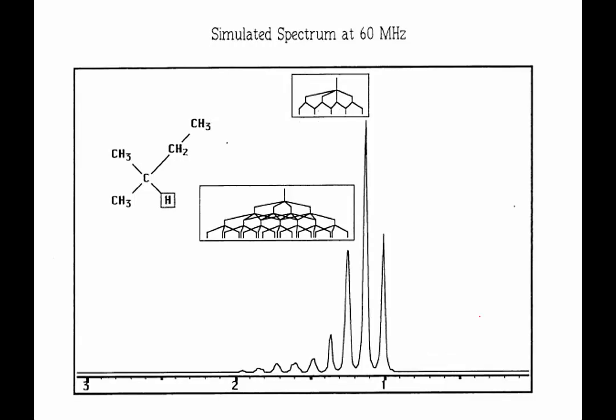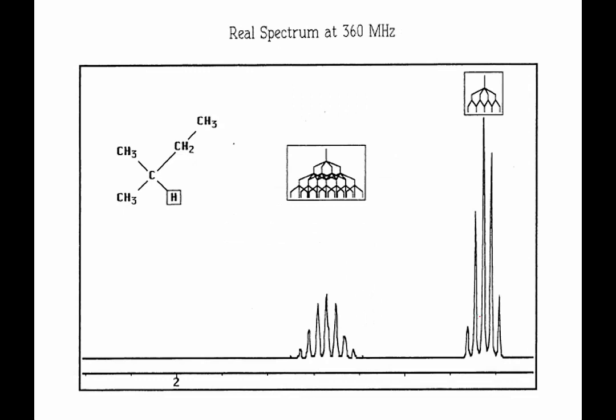So this is the best example. This would have been what I had to learn, which I like to think is why I got a C in spectroscopy in my undergraduate career. Then I just went and did graduate work in it and still do it. So it doesn't mean C's are going to kill you for life. Unless you're going to medical school, I guess. But I got to see this stuff and I'm teaching it. What does that say? But I like to blame the fact that I couldn't make heads or tails of their NMRs because they're all squished together.